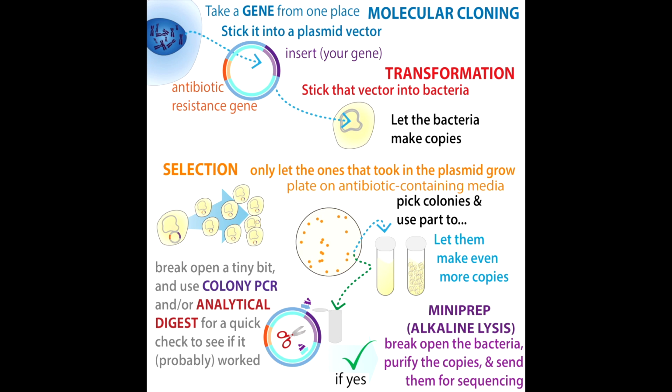So when you originally spread all that bacteria all over, you might think, if you didn't have antibiotics, what you'd get would be like a big lawn. So basically it'd just be covered in these bacteria. But instead what happens is that only some of the bacteria actually take in the plasmid, and only some of the plasmids actually have your insert inserted.